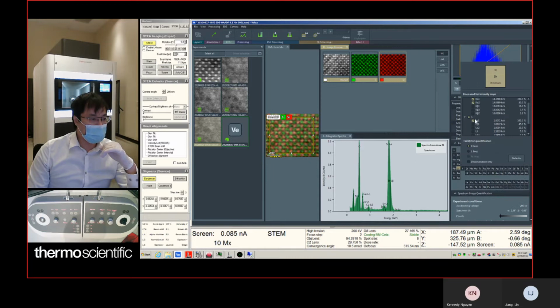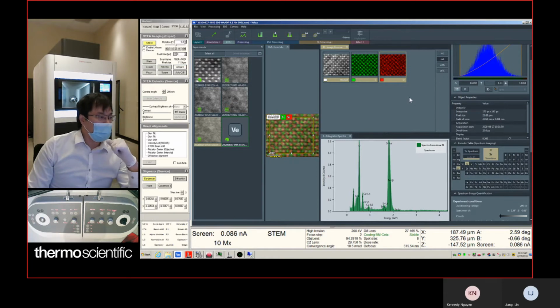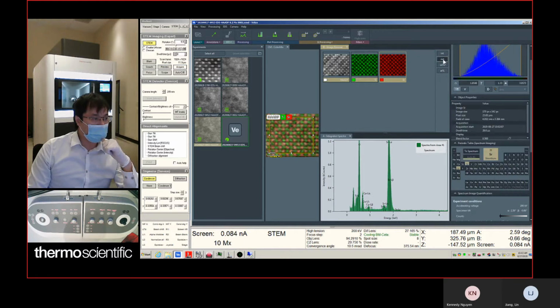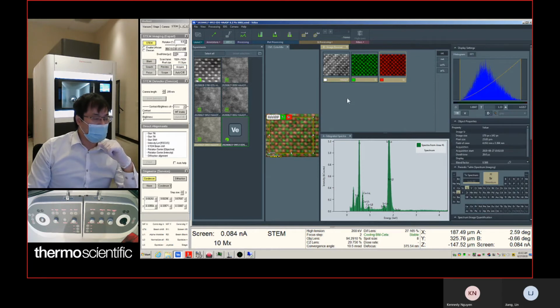Probably select strontium. Yeah. Let's collect a little bit more signal.